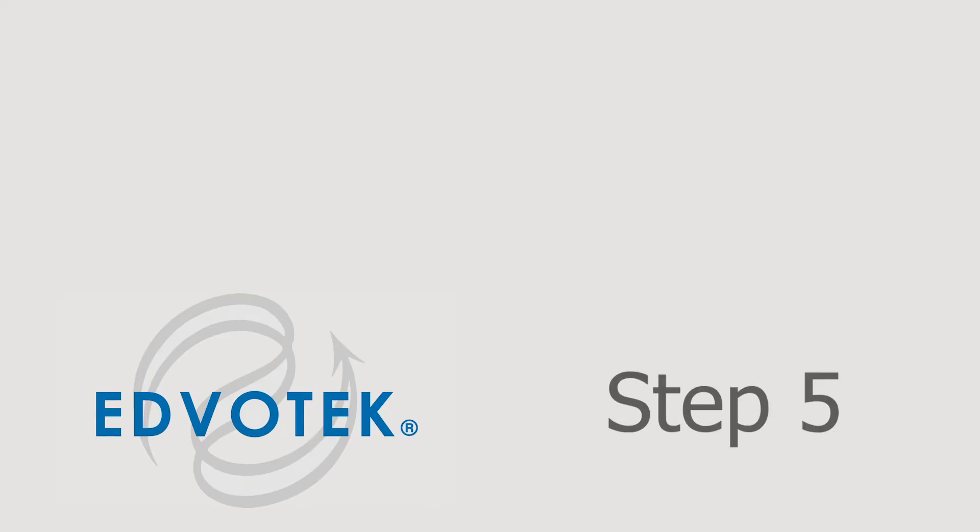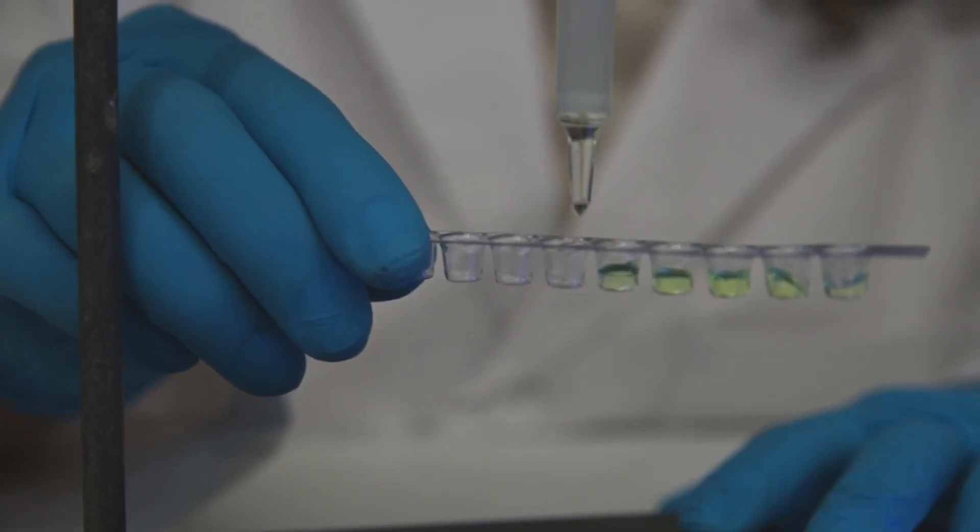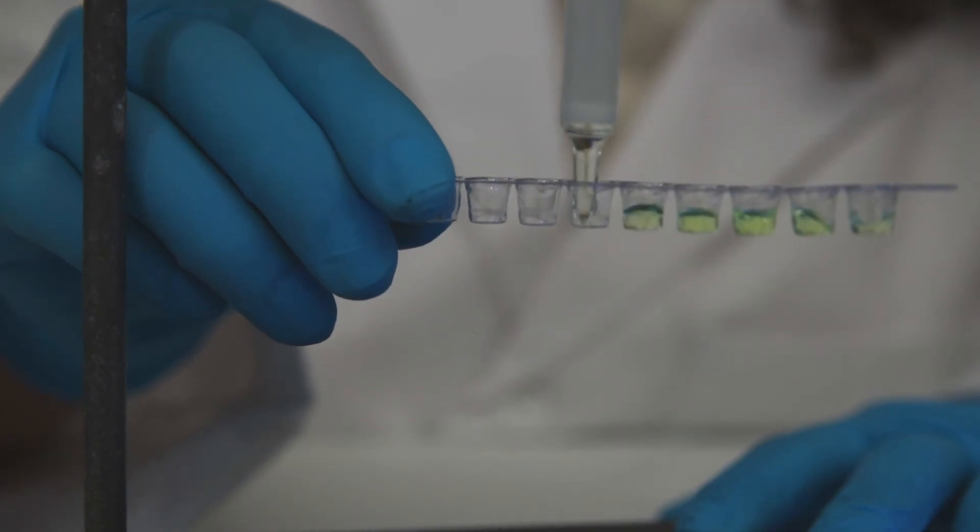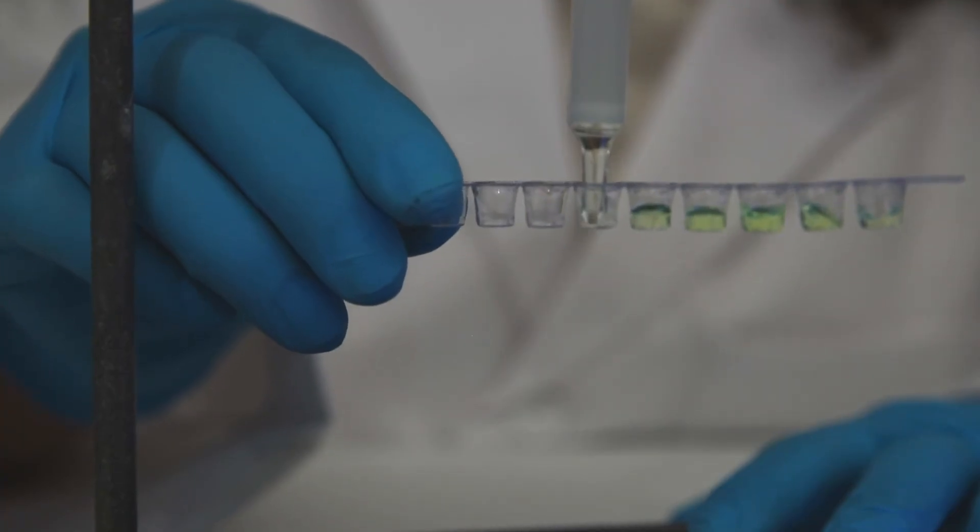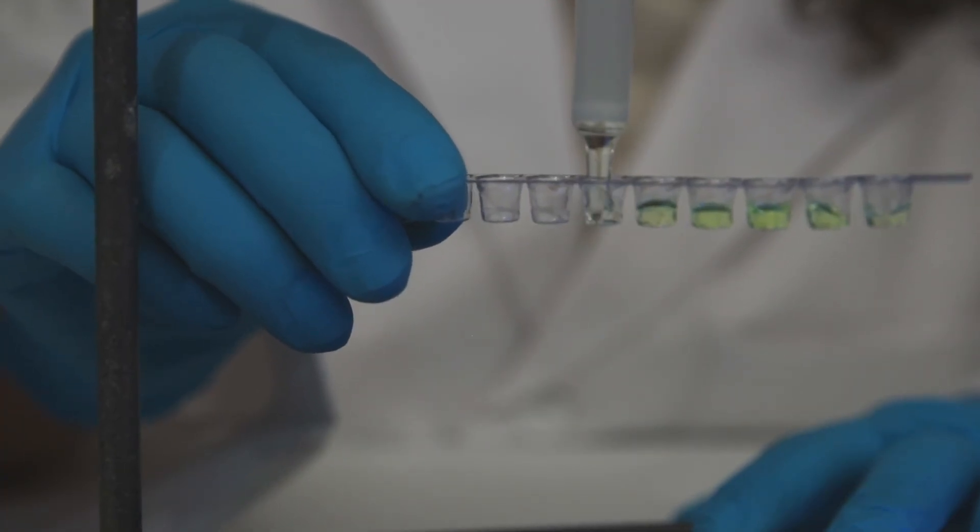Step 5: Continue to monitor the progress of the GFP in the column, and collect fractions until the GFP has been completely eluted. The column can then be capped and set aside.